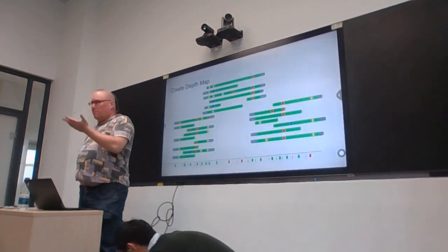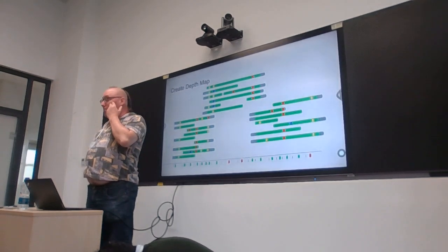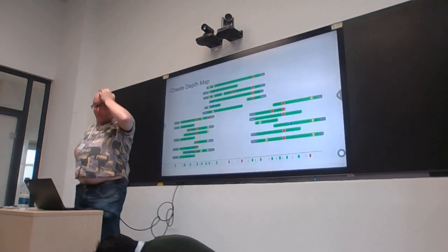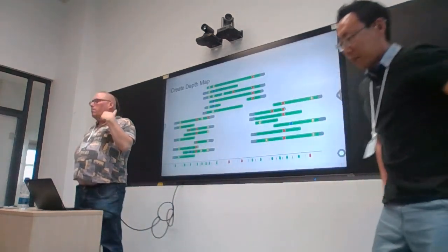But in general, most people were saying if your CT value is higher than 30, then don't sequence. I'm going to use the plug just now. I think leave it open.